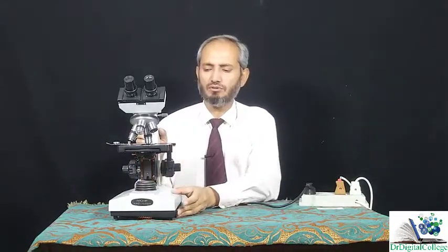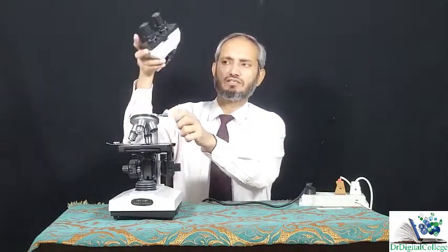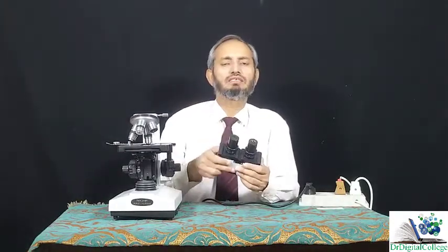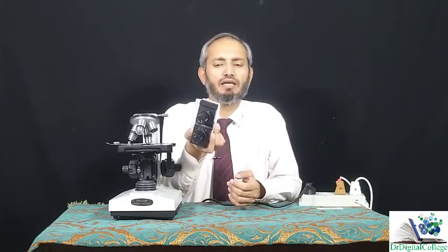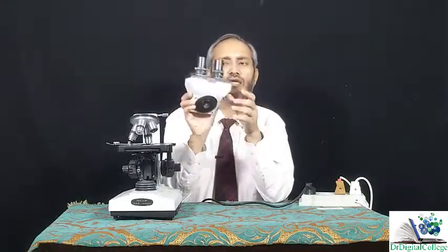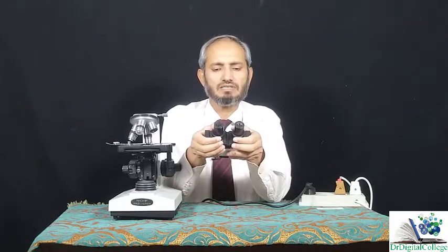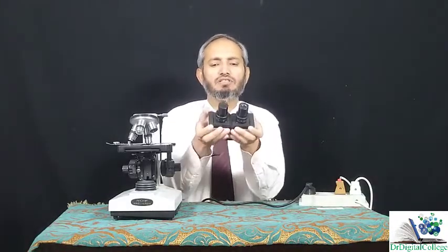Now before starting the working of this light microscope, let me tell you what its different parts are. First of all, this part here can be removed. It is a removable part. While you are working, you need not remove it. It is basically removed by the technicians in the laboratory so that they can clean it. This piece is called the eyepiece. It has two eyepiece lenses, and they are attached with this diopter.